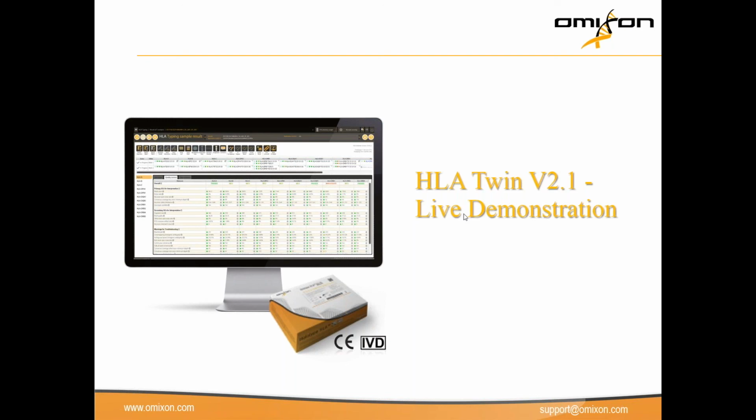I just received another question actually related to that. What is the throughput of the microflow cell? How many samples do you fit and how many loci in that? What is your normal? We use 24 samples at 7 loci, and that's really very fine. We get really, really good results from that.